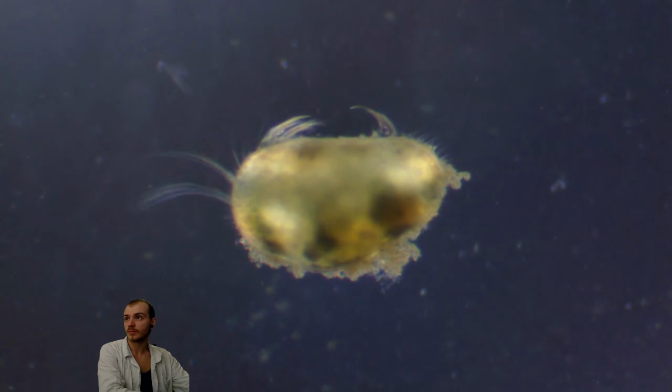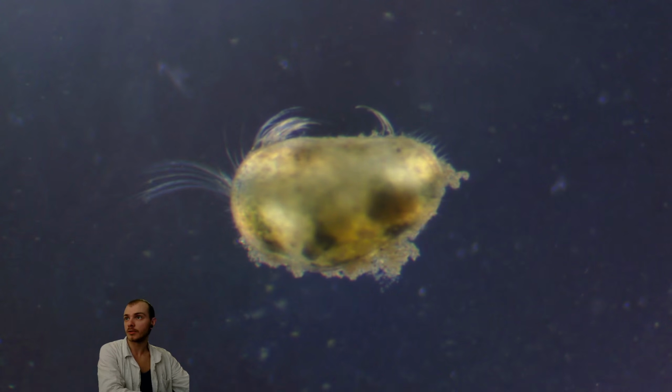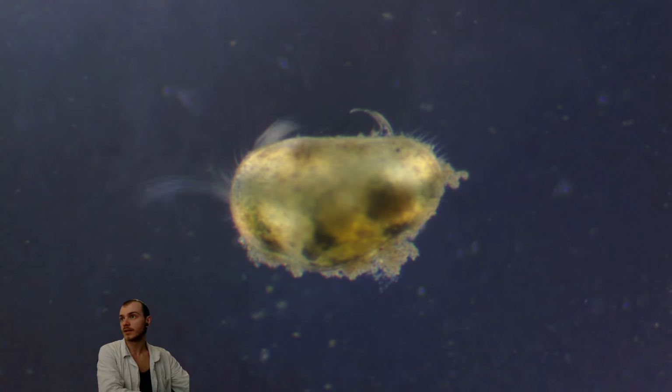I think I can take more water from them. That is too much, so they will not be moving again. Oh, here they are moving at least somehow. So yeah, this is an ostracod. You can see its legs.